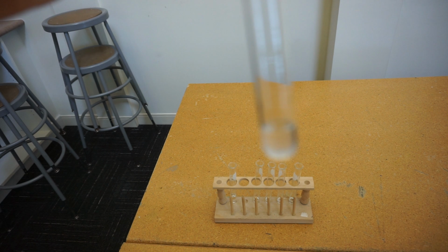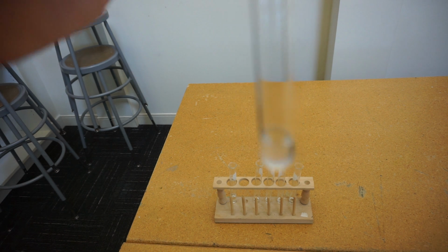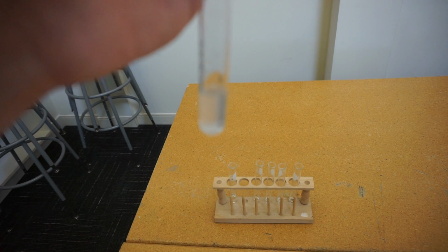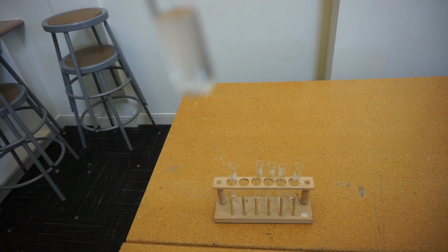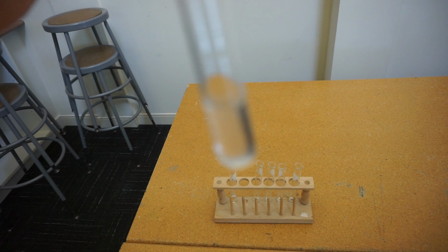Next one is ethanol, so an alcohol that I'm sure you have some awareness of, and as we would expect, when we add water we get good mixing, which is what you'd hope to see, because otherwise any of the alcoholic beverages would have separation.